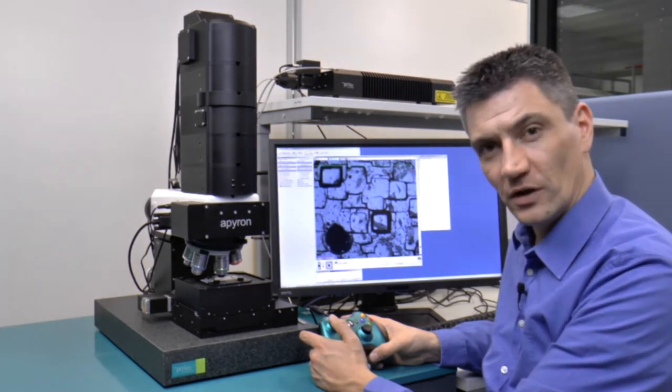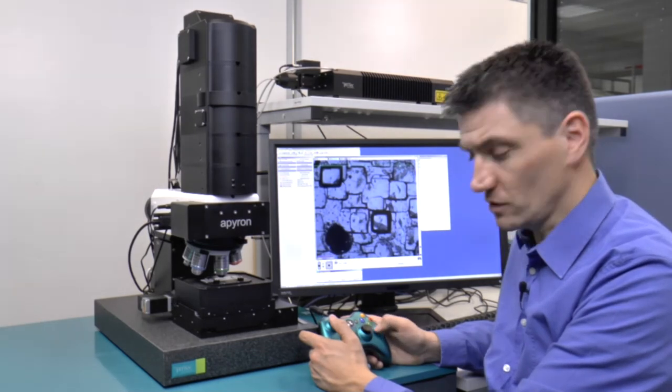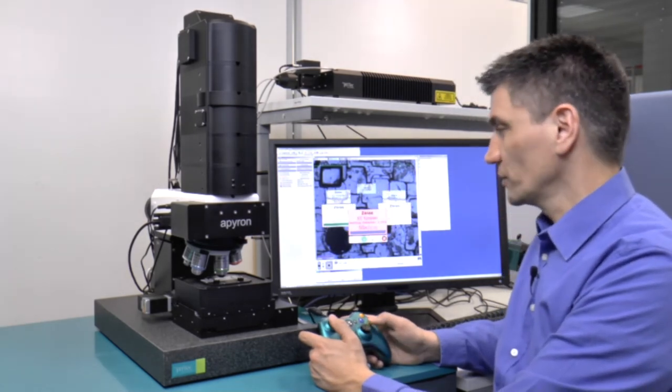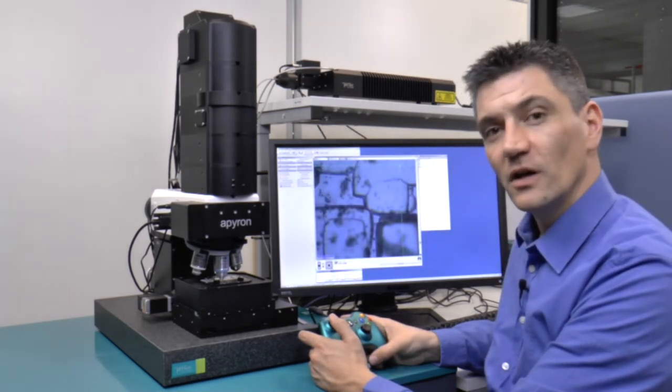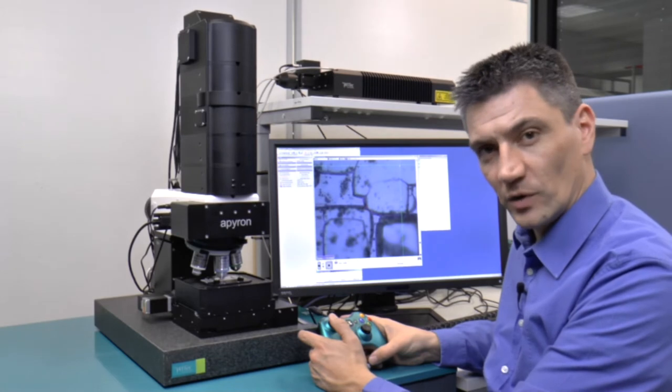At the moment we've chosen the 20x objective, but we can simply change this by selecting, for example, the 50x objective. It now compensates for any XYZ offset and does an automatic white light illumination adjustment.